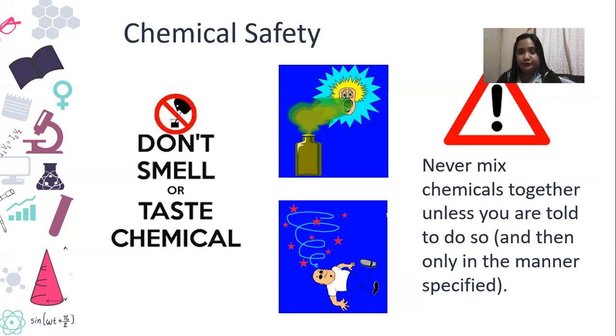You wouldn't know what reaction might come out of that mixture. Also, it might touch your skin, touch your clothing, and who knows what. So please just follow the steps laid down on your experiment and never mix chemicals together unless we ask you to. Okay?